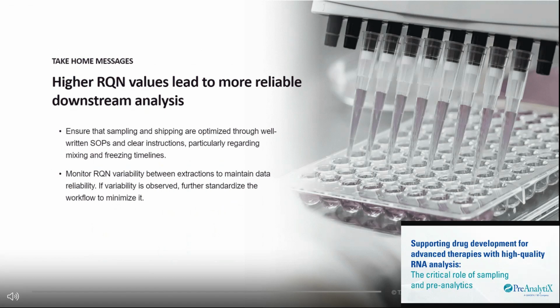For some take-home messages that will help you forward is to make sure that the sampling and shipping are optimized with clear instructions, especially for the mixing and freezing timing. And monitor your RQN variability between extractions to keep the data reliable. And if a variable appears, standardize the workflow further to reduce it. And these steps help you to ensure sample quality and consistency for trustworthy results.